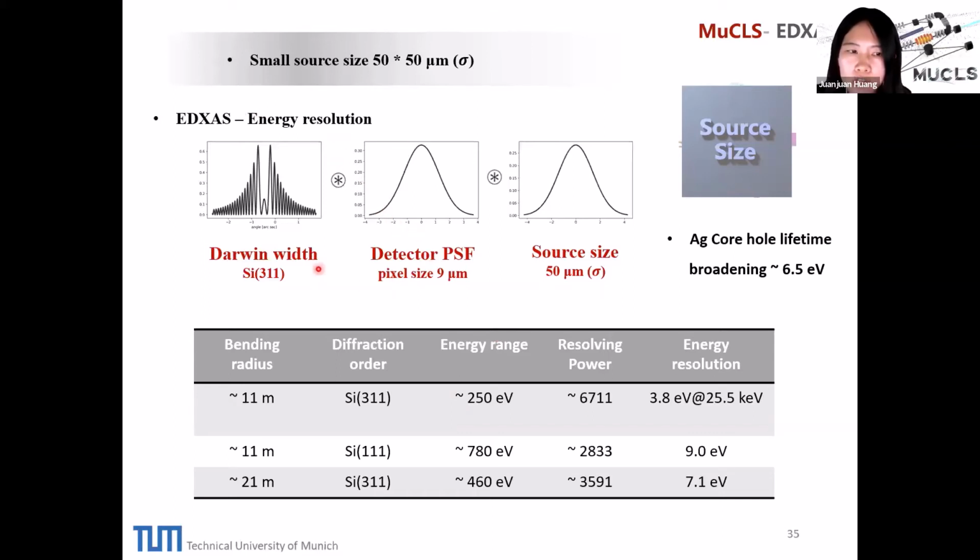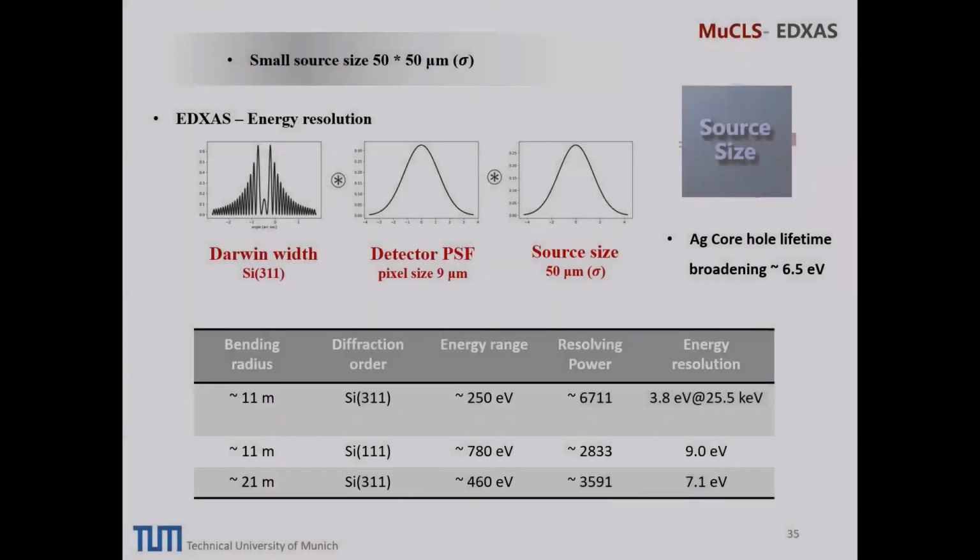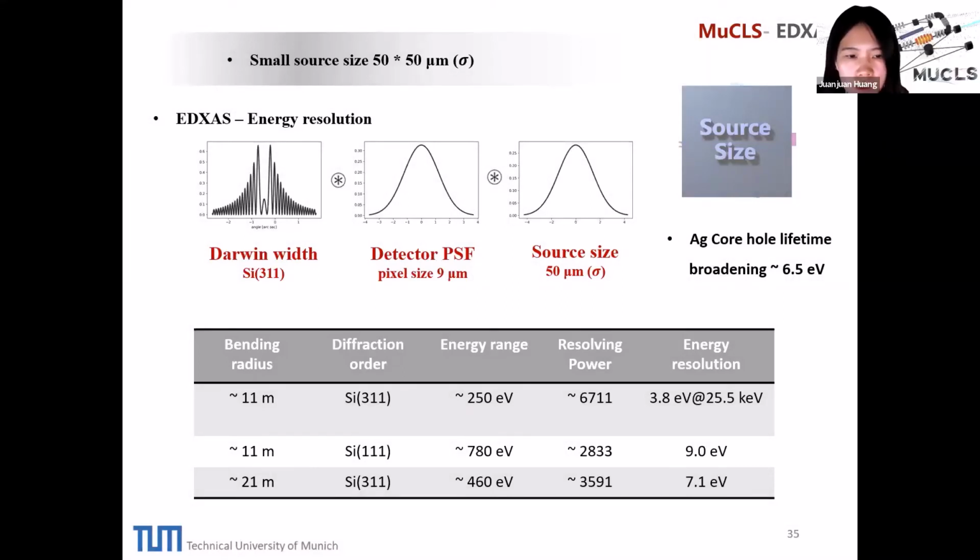Okay. So for example, in this example, the source size is the dominant factor, and of course, this maybe I can show you how. Oh, sorry. It's okay. Maybe I can show you how the energy resolution was determined.